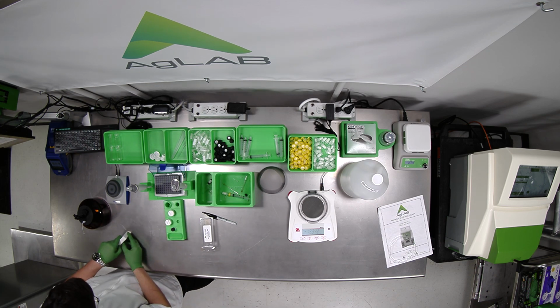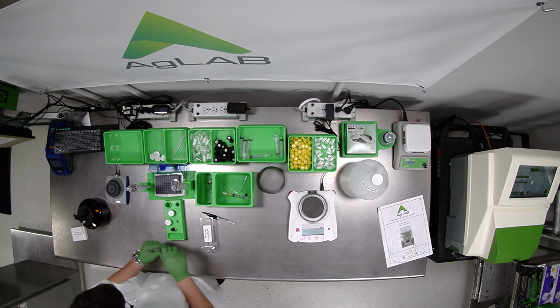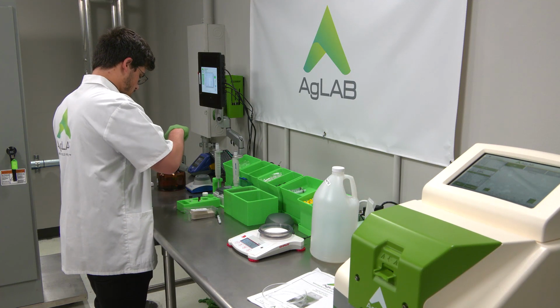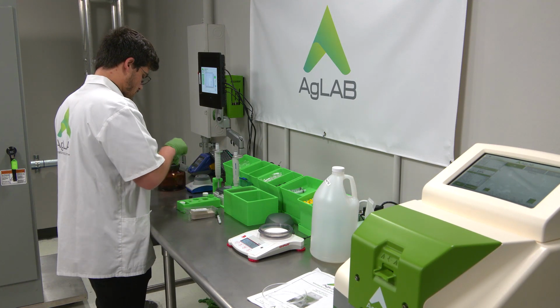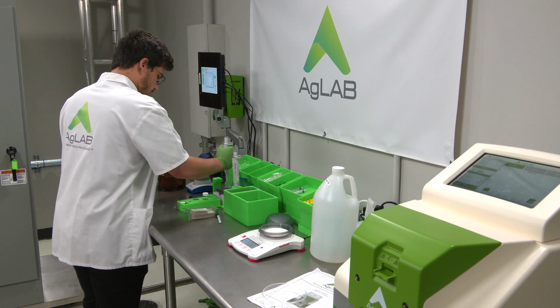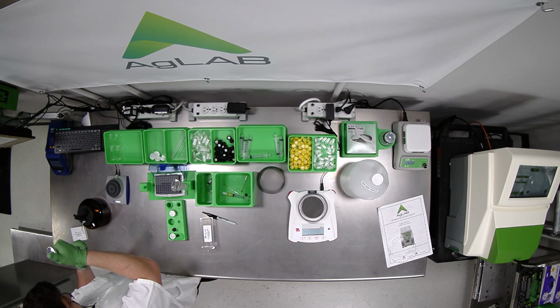And grab an internal standard. Okay. Microliter transfer of D1 solution into our D2. Rinsing 2, 3, 4.